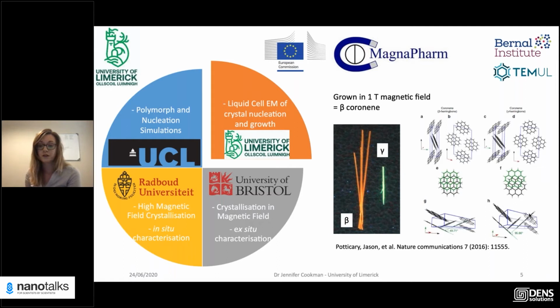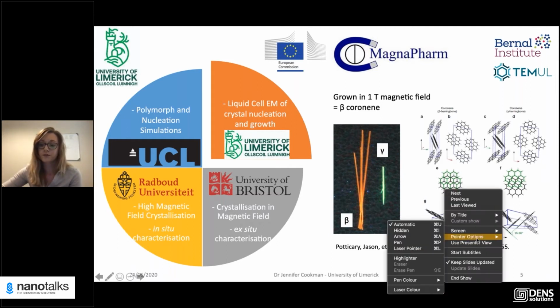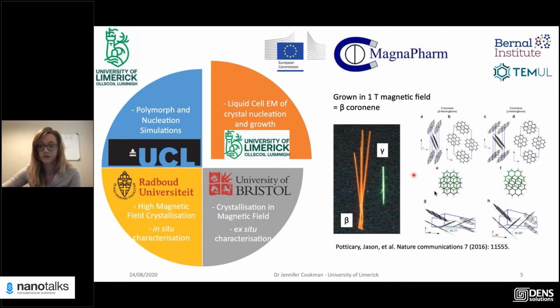These have different unit cell parameters, as you can see on the right. Sorry, I'll just get my laser pointer out. So the unit cell is constructed slightly differently, and then attached to that, it has different optical properties. So the hypothesis of this experiment was then used to apply to active pharmaceutical ingredients that would have some sort of a symmetrical component, like a diamagnetic component to the molecule. And then the project got funded, which is fantastic.